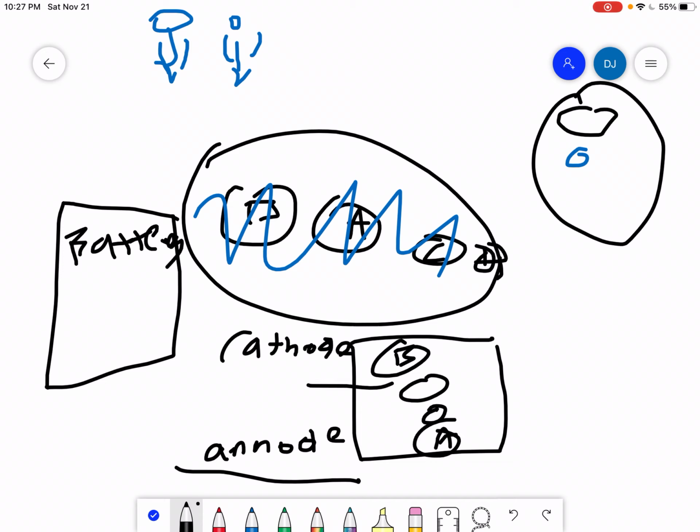And if we know the relative sizes due to this gel electrophoresis setup, we can easily create a restriction map and say, okay, this gene is X base pairs long. And so that's basically gel electrophoresis.